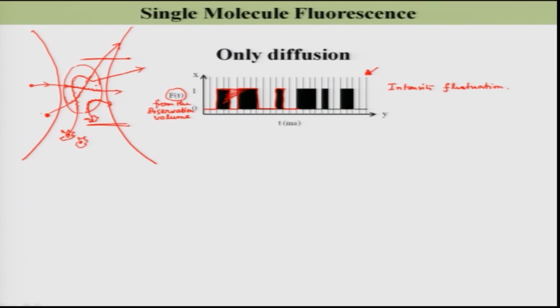But if these fluctuation widths are more, if it is on for a longer time, let us say it is on for this whole time region, then it is off, and then it is on for this whole time region, then even for this case, compared to the black one, after a certain time the self similarity will remain very high, right.